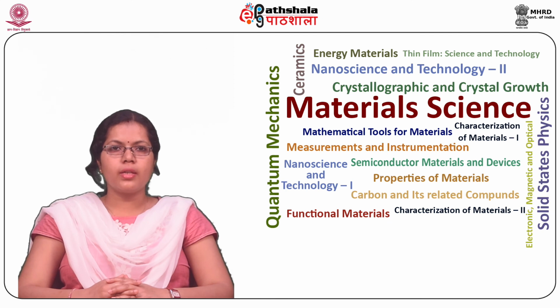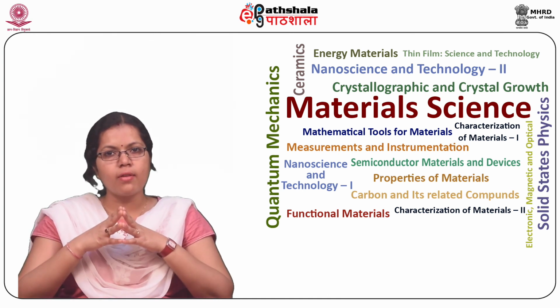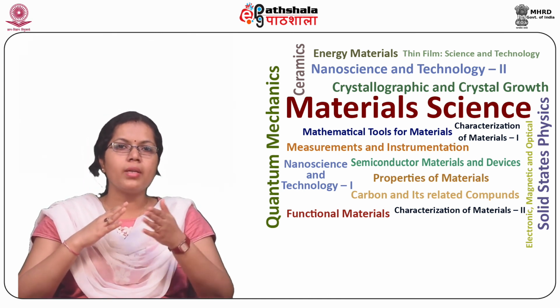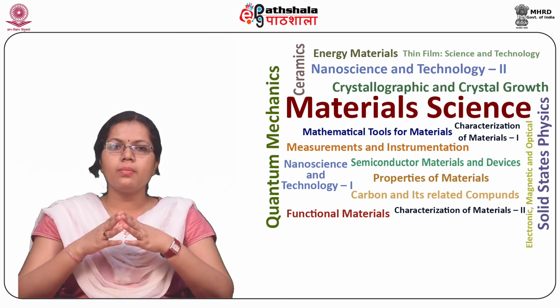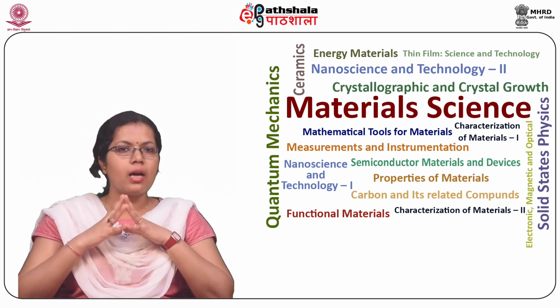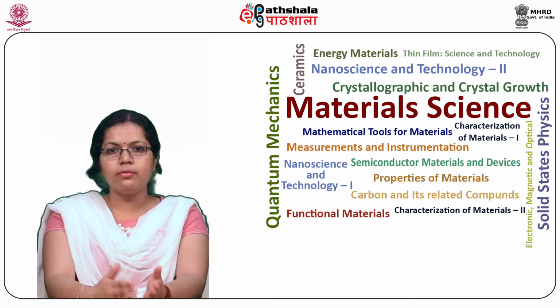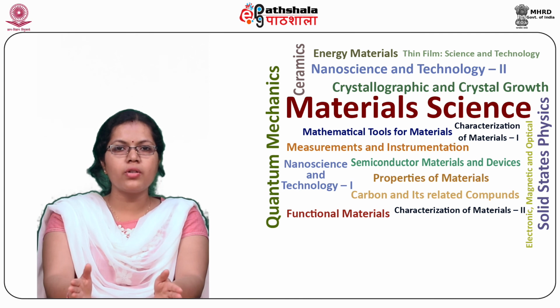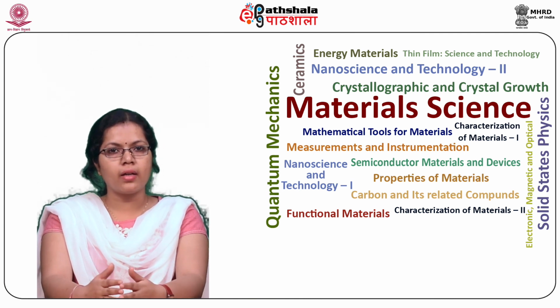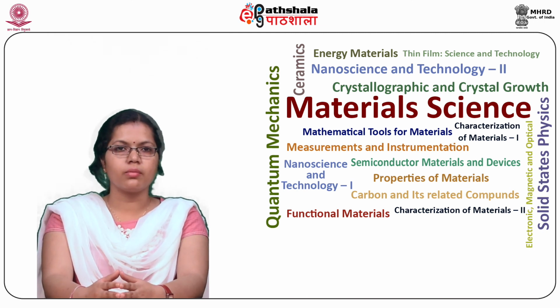Now, students, let us see the stimulated Raman spectroscopy, or SRS. SRS is another nonlinear process, which stands for stimulated Raman spectroscopy. The basic principle of this coherent phenomenon is based on the incidence of two photons, pump and Stokes, like the CARS principle. The two laser beams coincide on the sample. When the frequency difference matches the molecular vibration frequency of a bond in the target molecule, this will induce stimulated excitation in the vibrational transition.